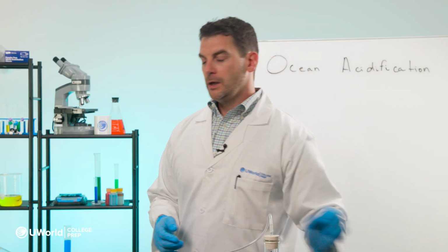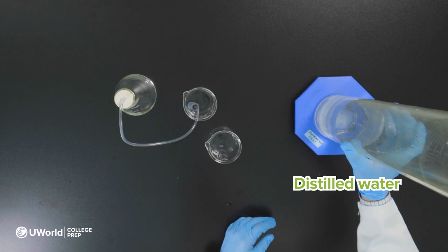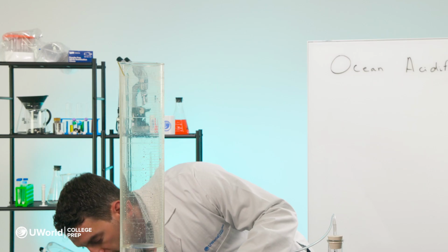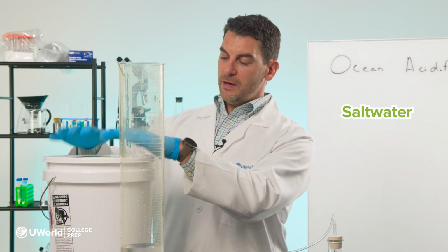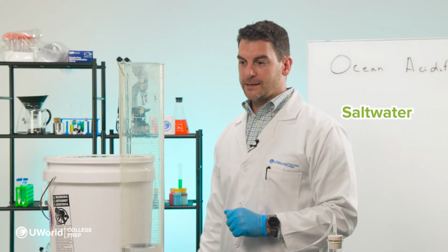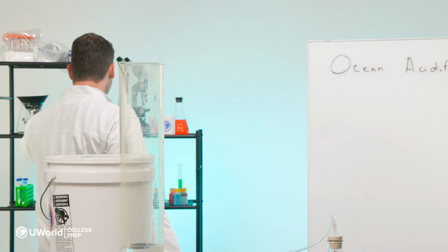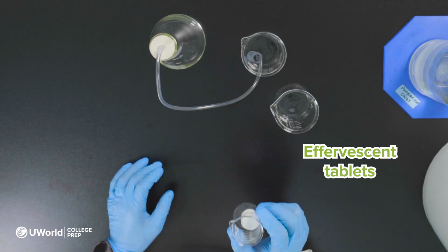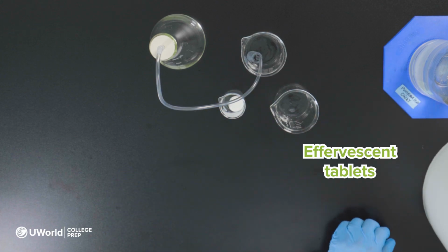We'll need our water. Obviously, we need a lot of water. So here is some distilled water. We also have our salt water, and this salt water is going to mimic our ocean water. I prepared this earlier, which is why it's in a giant bucket. Next, we'll need some effervescent tablets. These tablets dissolve in water and serve as our source of carbon dioxide.